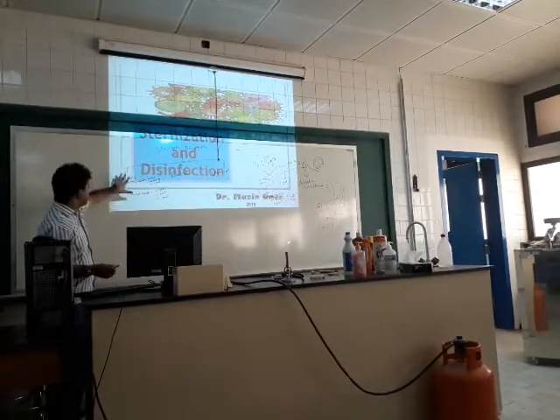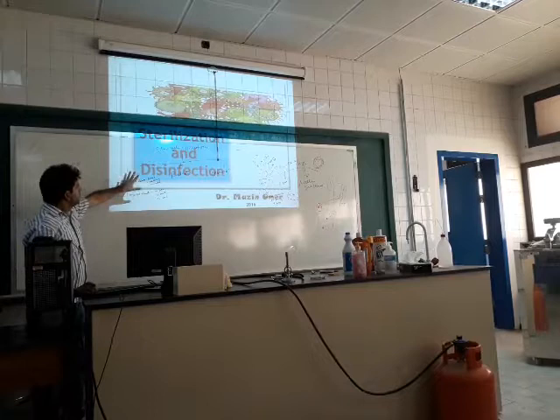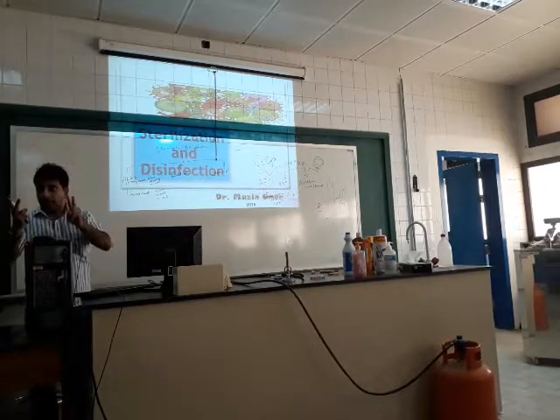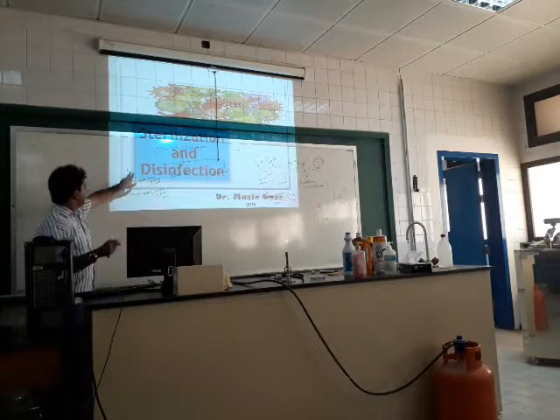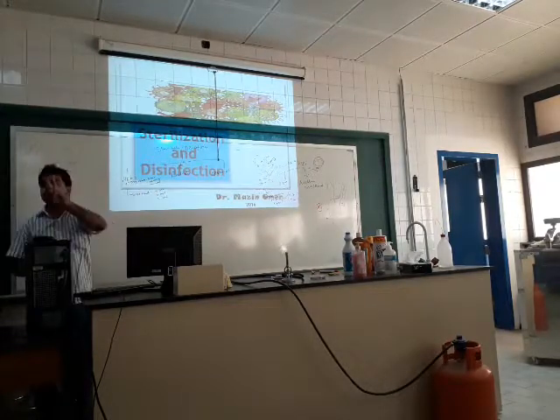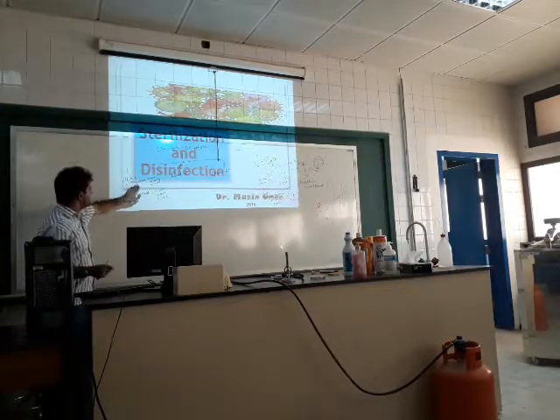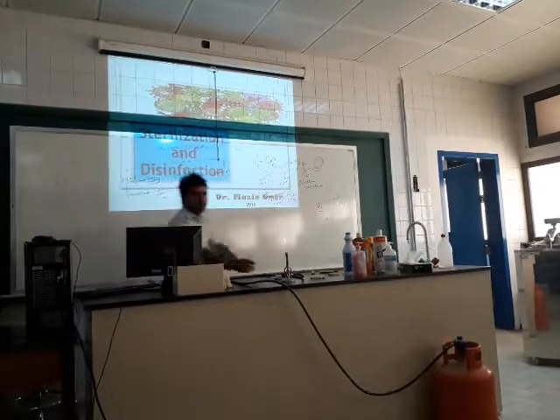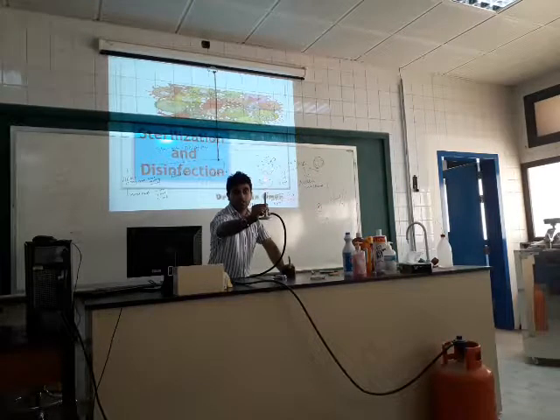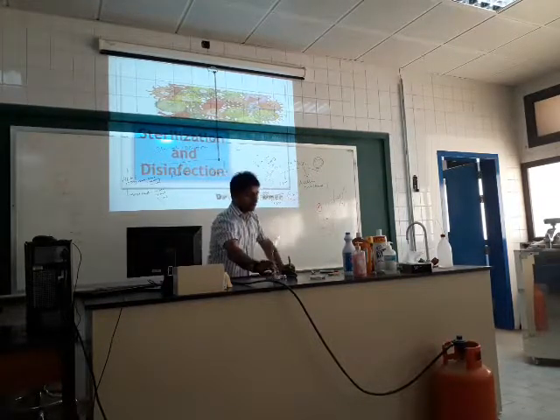So let us see about the heat. This is a method for both sterilization and disinfection. One method is heat. Two forms of heat we can use: one is dry heat, another is moist heat. Let us see the first, dry heat. Flame. This is the flame. This is called dry heat.